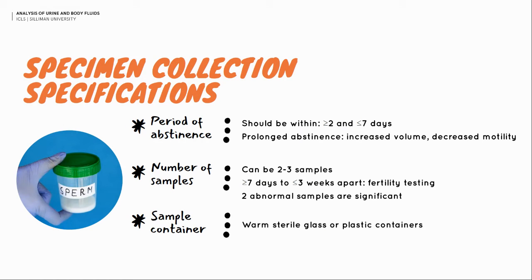Now, for specimen collection specifications, the patient who will be tested for seminal fluid needs to abstain. First, they should not masturbate for 2 to 7 days, and no sexual intercourse. So no method of ejaculation, meaning no release of sperm.